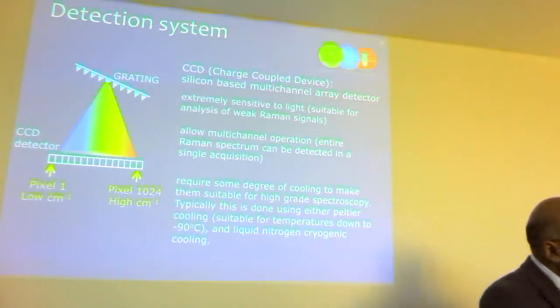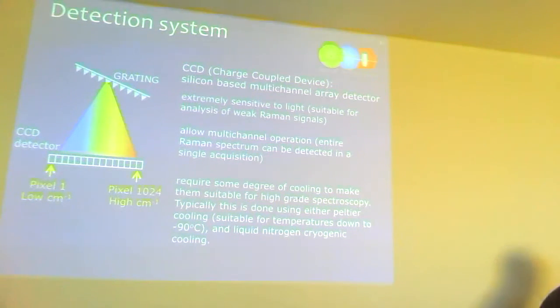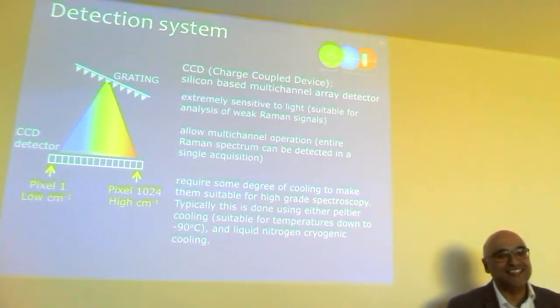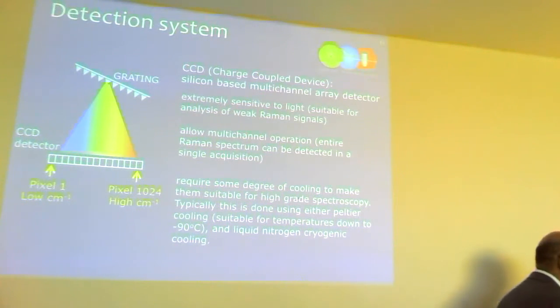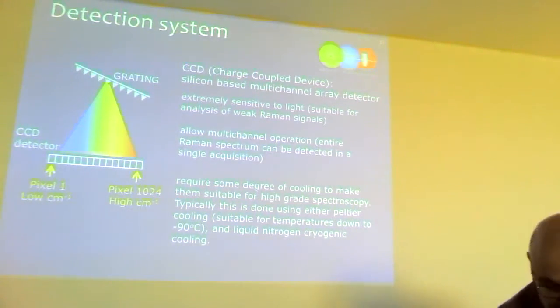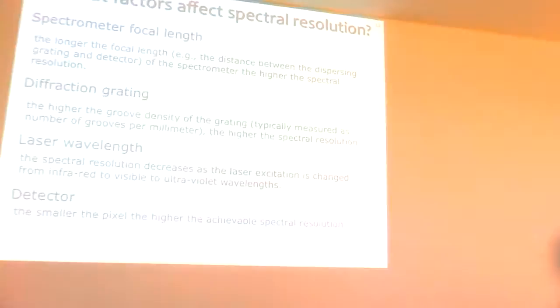So usually near-infrared light being in the therapeutic window, Raman scattering typically goes as 1 over lambda to the 4. So if I go from 1064 to 532 nanometers, I'll get a factor of 16 improvement, but the problem is 532 is a little bit more harmful to cells than 1064. So people stick to around 780 near-infrared wavelengths to make it basically safe for biomedical specimens. So these are the kinds of things you might need to think about.